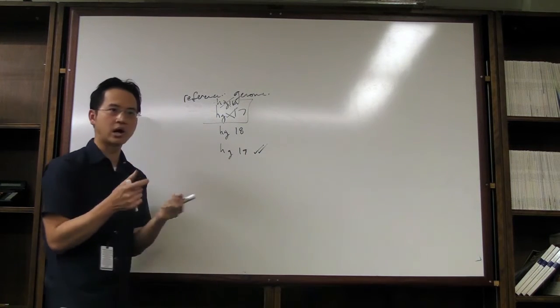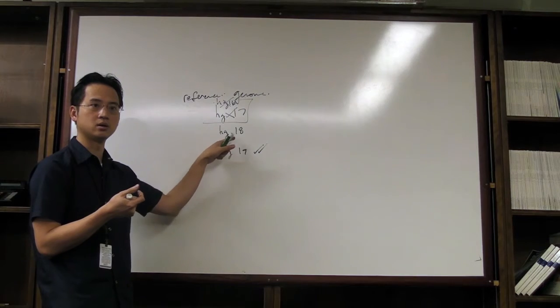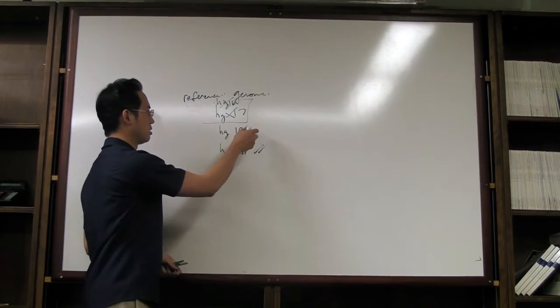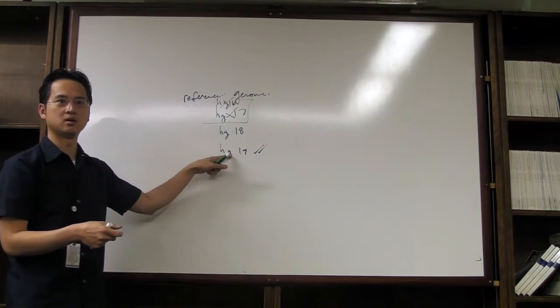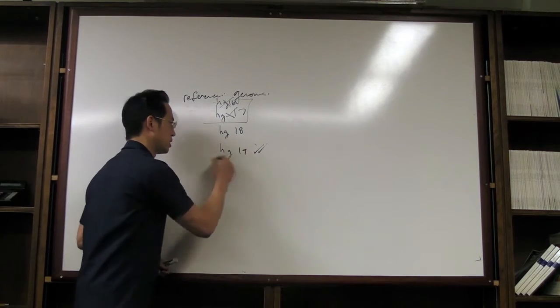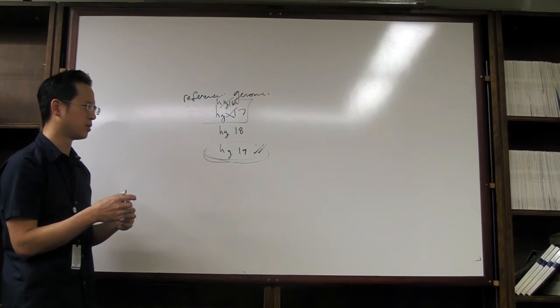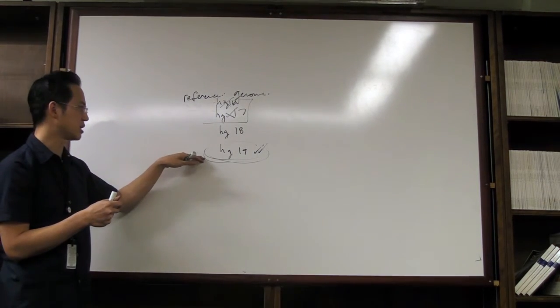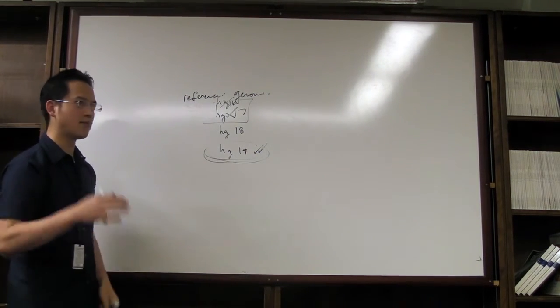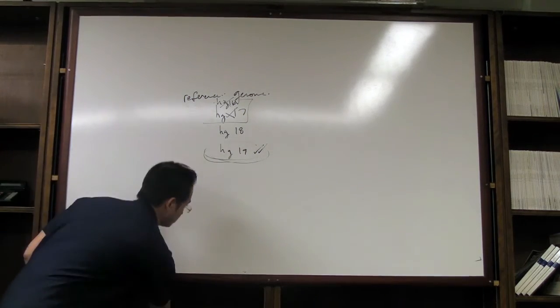So whenever you report out a coordinate on the genomic level, it's absolutely necessary to report out the version or the build that you're using. Because if you take a coordinate here, it has no meaning in here. So there are some conversion tools, but you want to take this one. You can download from NCBI, from I think the Broad GATK has a version as well. Ensembl has one too, but you want to use HG19 as your reference. So when you say, I map my data to HG19, people are going to know what you're talking about.